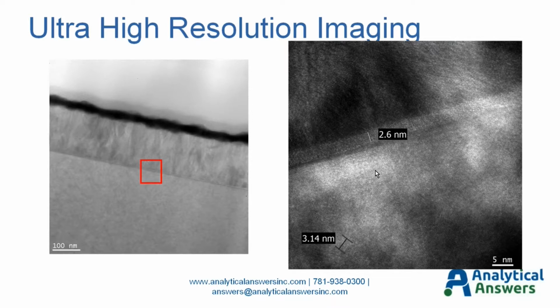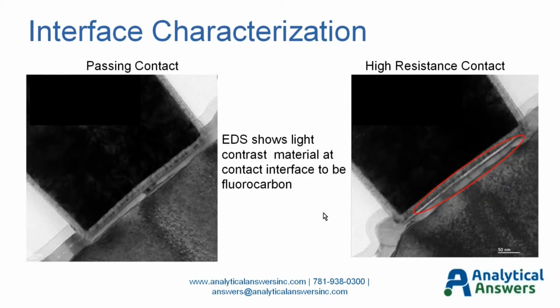So very high resolution imaging capability. And a very accurate measurement, since again, we can refer that back to the silicon lattice, the known lattice spacing. So from that example, you can see that TEM is an extremely powerful tool for interface characterization.